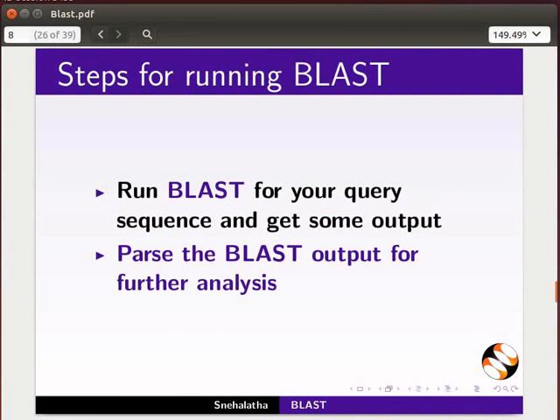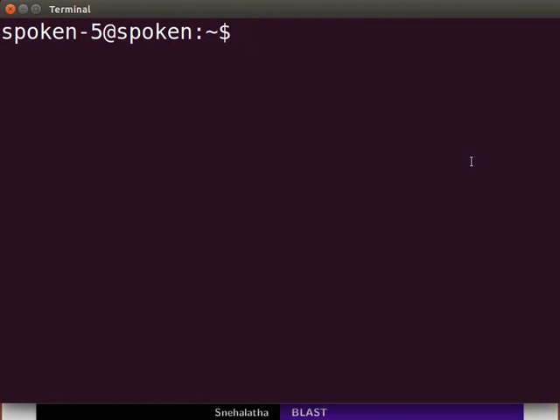We will open the terminal and run BLAST for a nucleotide sequence. Open the terminal by pressing CTRL, ALT, and T keys simultaneously. At the prompt, type IPython and press Enter.